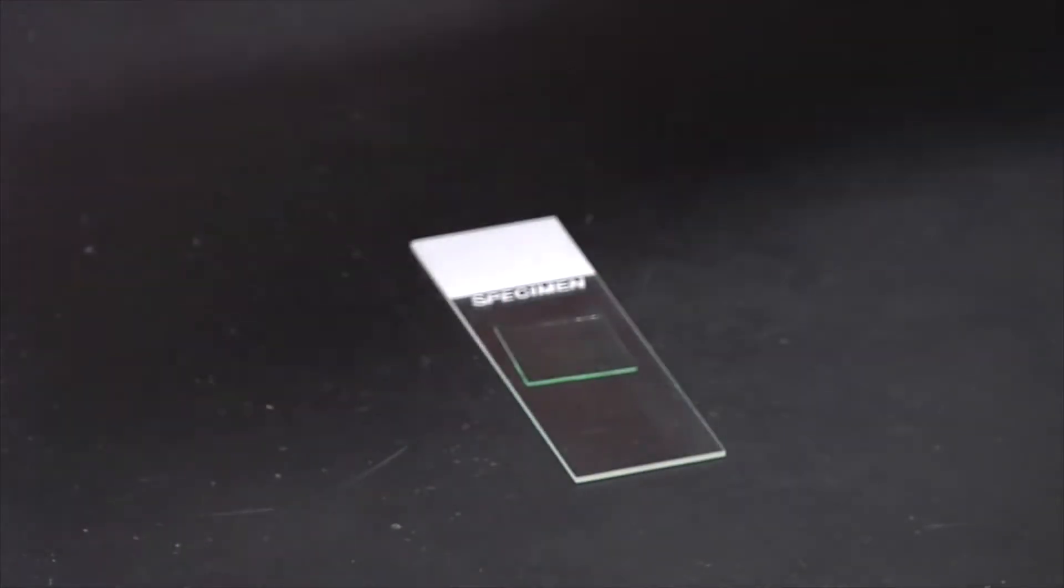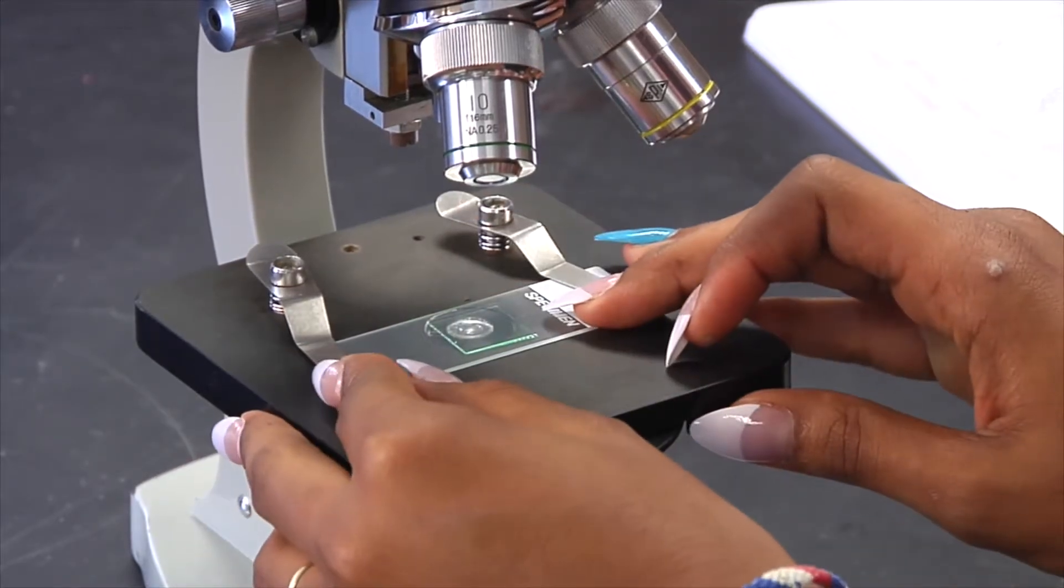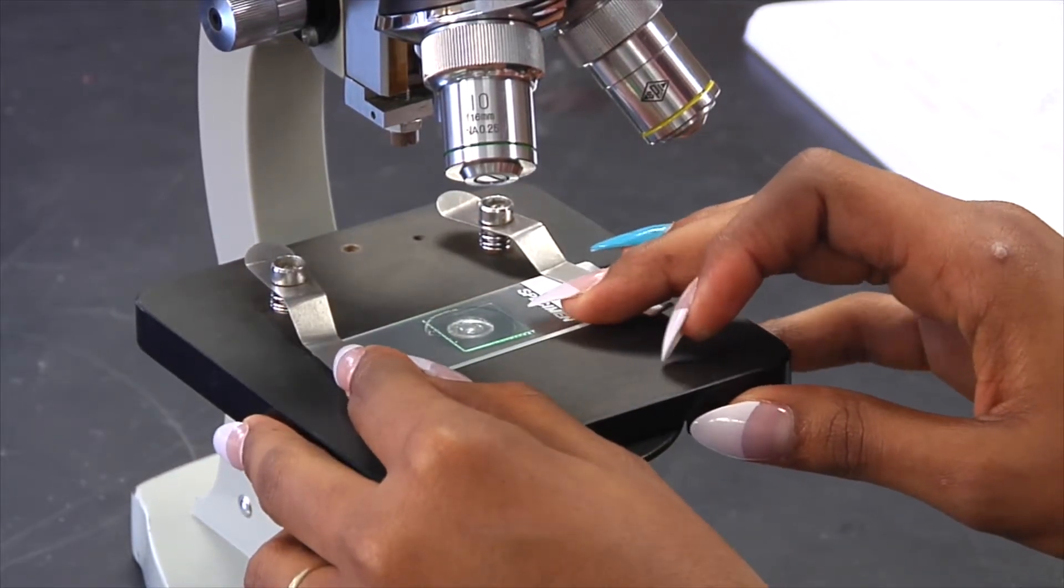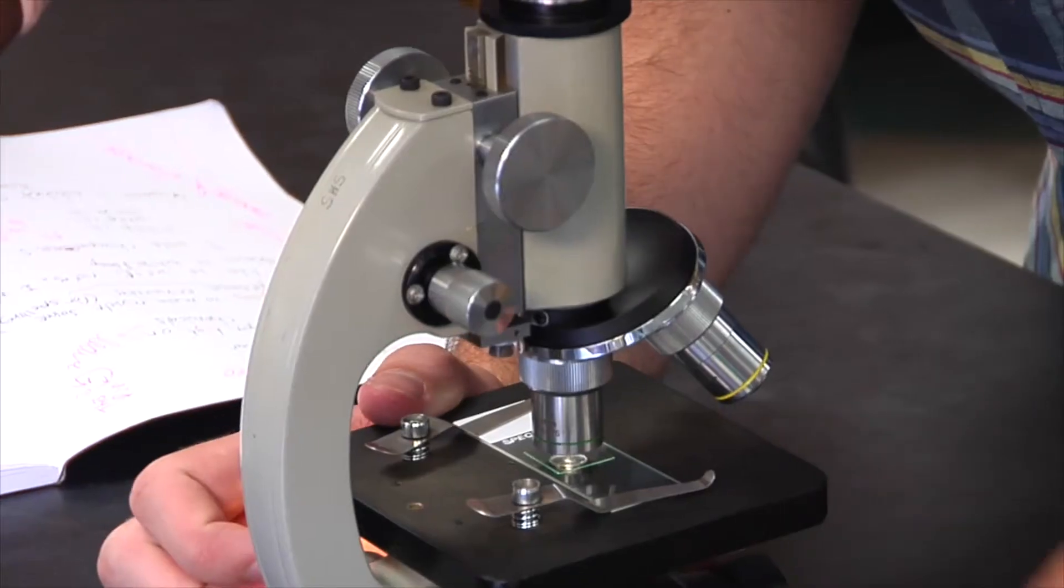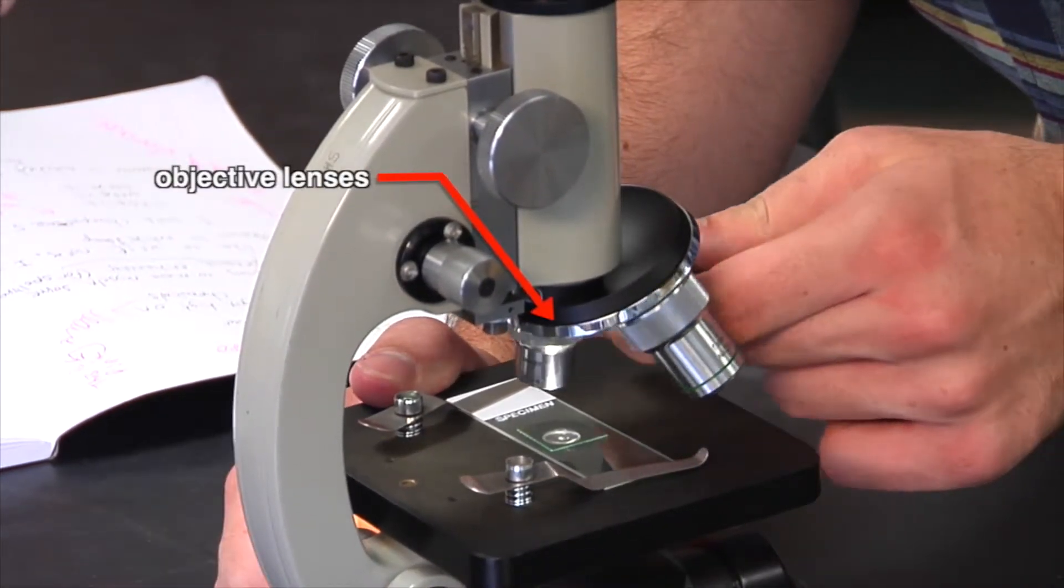The microscope slide is now ready for viewing. Place the slide on the stage of the microscope. Clip the slide in place so that it cannot move around. Turn the objective lenses on the microscope so that the lowest magnification lens is directly above the slide.